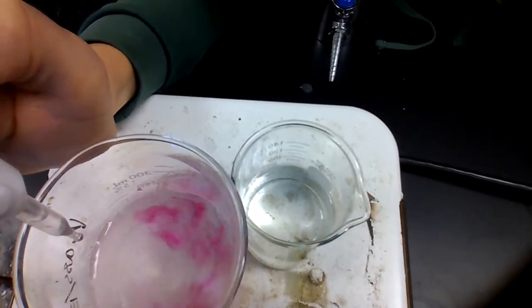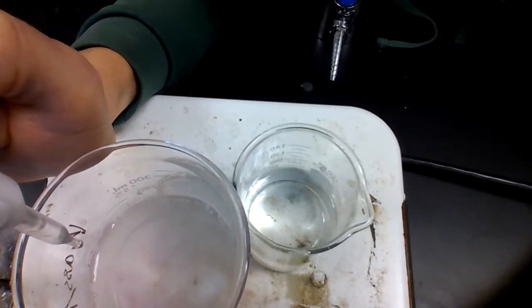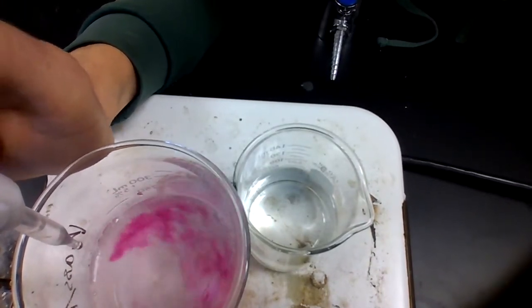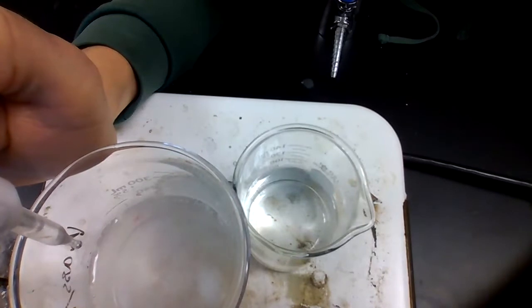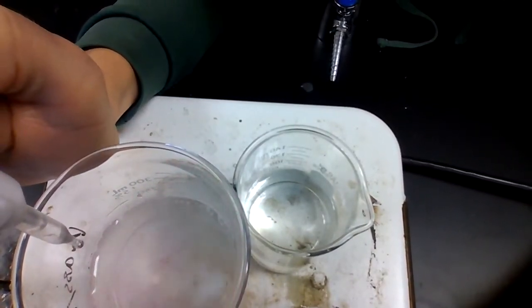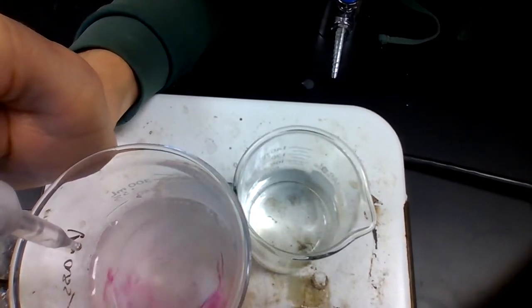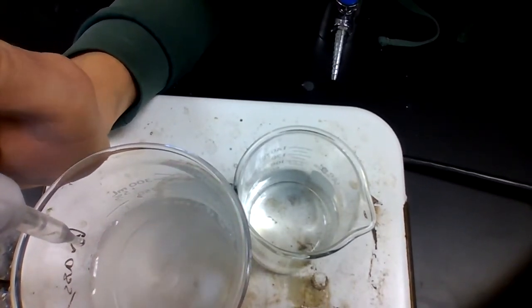If it keeps disappearing, then we're not done yet. Welcome to titration. It can be a mesmerizing experience, and it can be a frustrating experience.